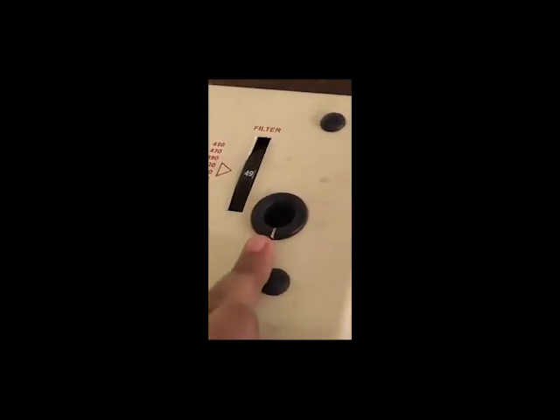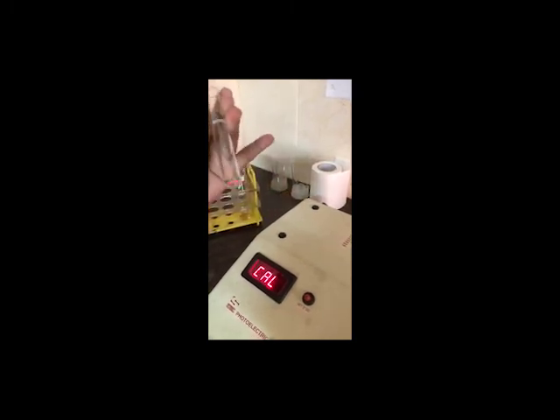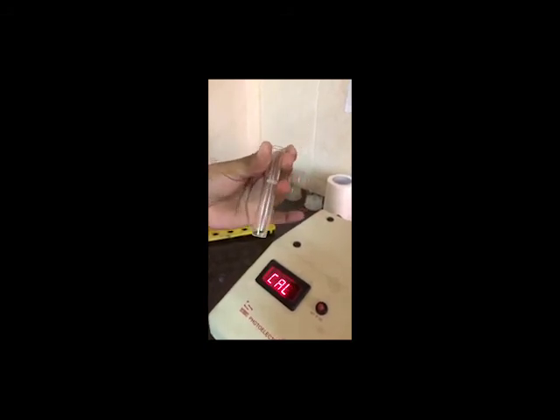The sample is placed here, in the sample holder or cuvette. Different shaped cuvettes are available, rectangular and circular. Here a circular cuvette is used. It is made of silica.